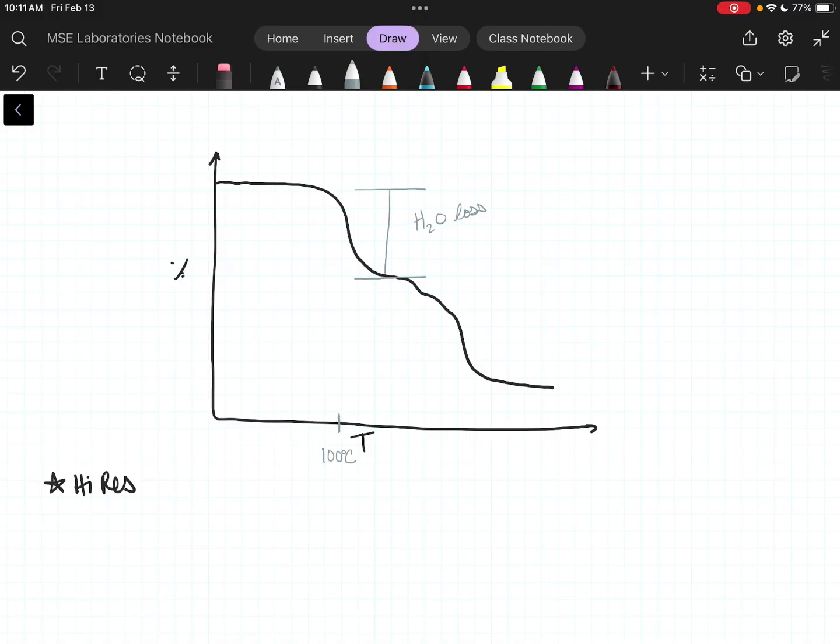Really commonly, on almost every sample, there is a little bit of water that the sample has absorbed out of the air. We live in Utah, so humidity is a minor problem to us, but it is still a thing. Sometimes it rains every now and then.